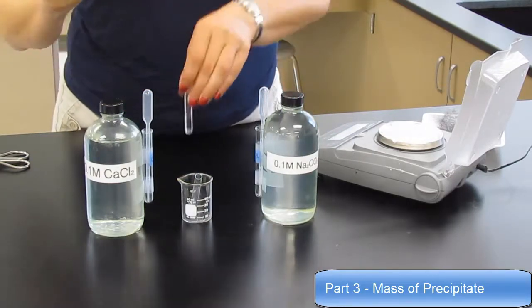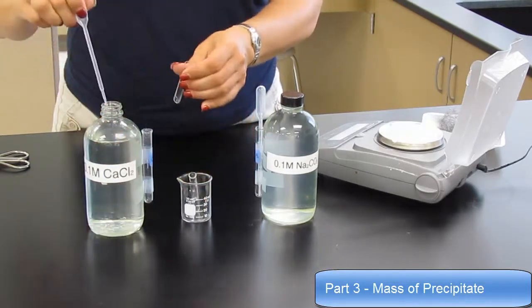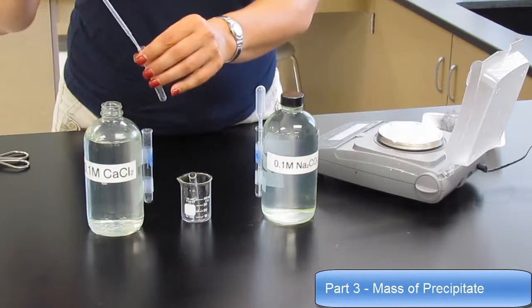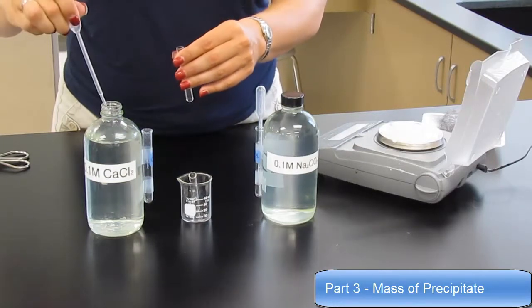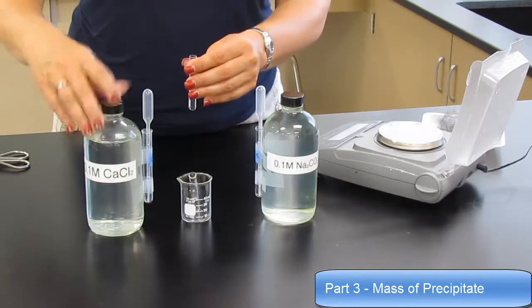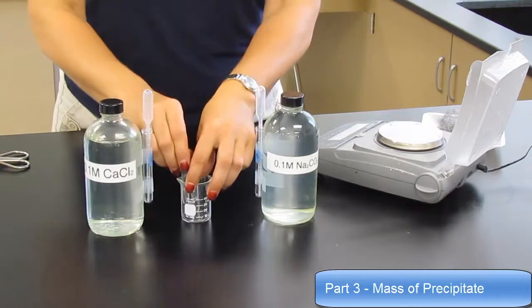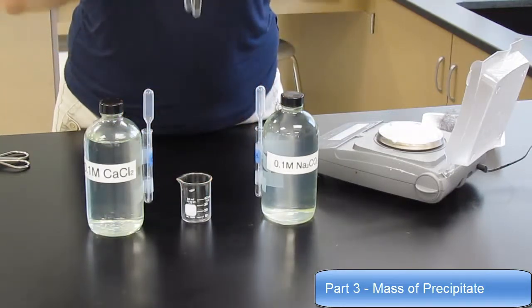Make sure you record observations about the chemical, and then do the same for the other chemical. The beaker is strictly there for holding the test tubes themselves.